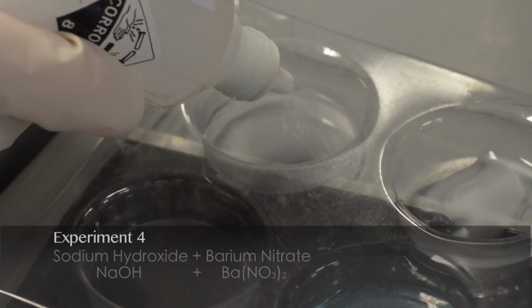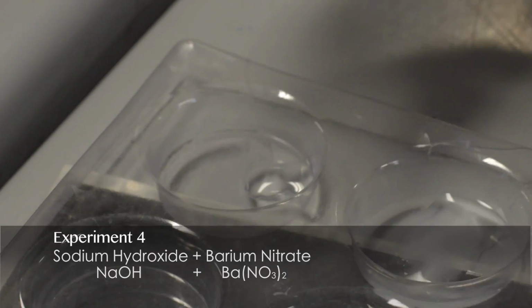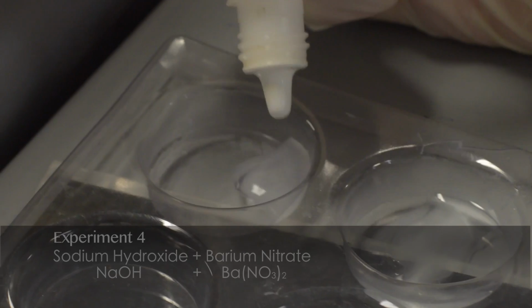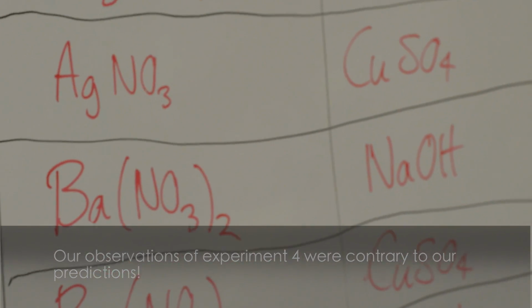Barium nitrate. There's the hydroxide. There's the barium nitrate. It's a precipitate. So which row is this on the table? Is that row 5?